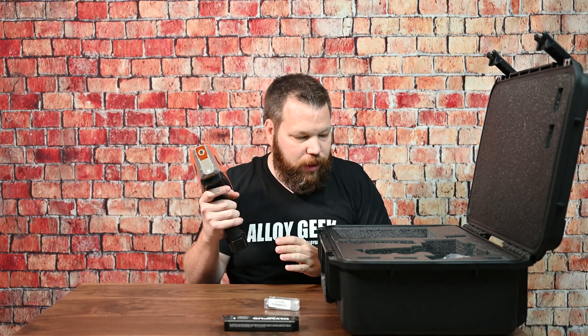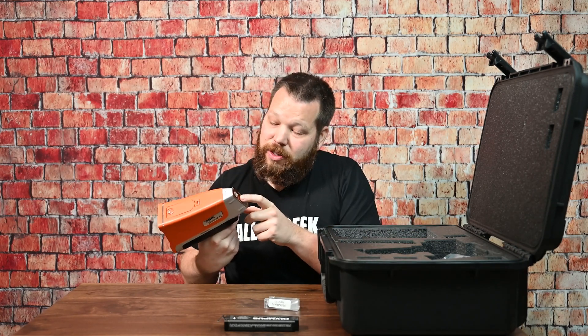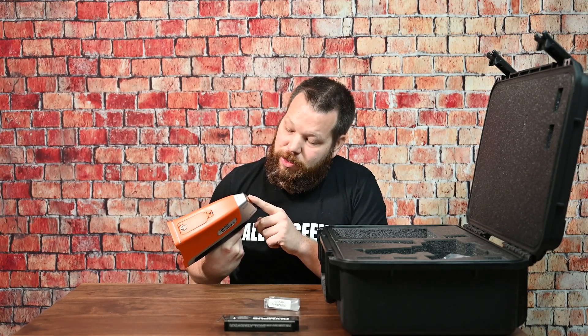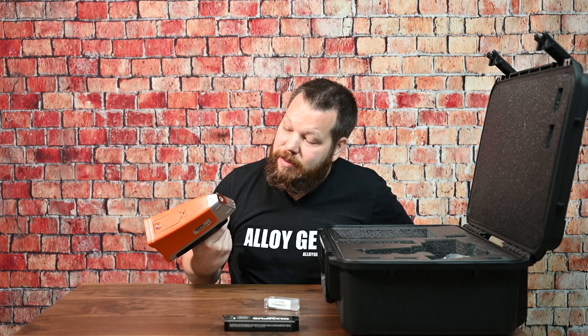The second thing I really like about this analyzer is the price point. It's a lower price point, an easier entry. Some analyzers can get kind of expensive. If you're just starting out or this is your first handheld XRF, this is a pretty good place to start. The other thing I really like is that the window sticks on the outside. The Vanta Element S came up with a nice design where you see the mesh backing on that window. That's a really great design — a compromise of both protection for the analyzer itself, the tube and the detector inside the nose of the unit, and also making sure you can see those light elements, which we need to see in most of the industry today.